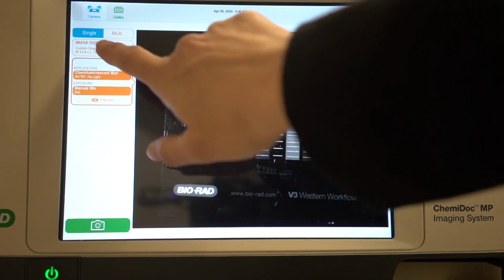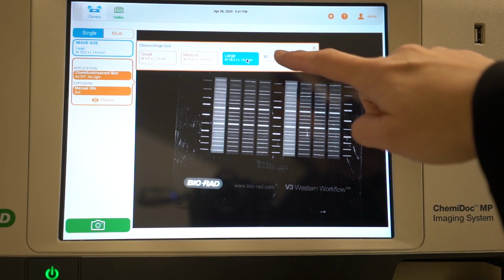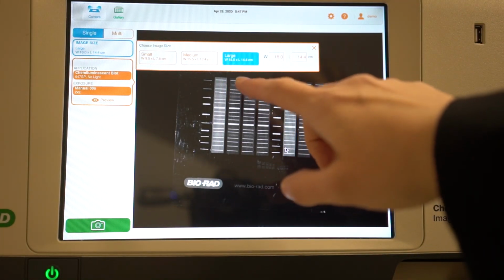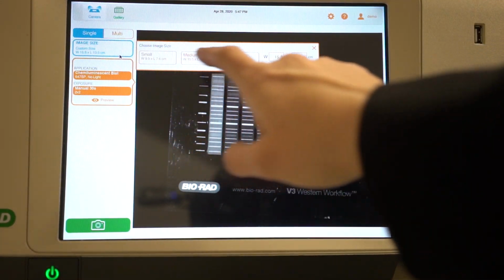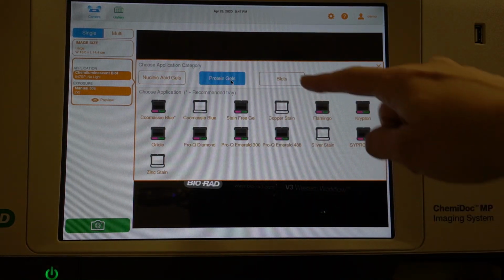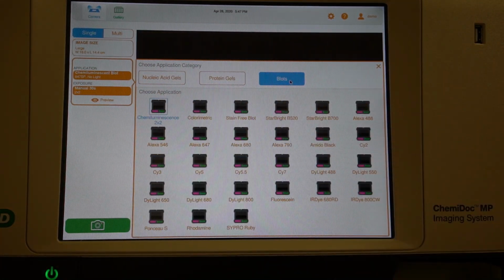The next block down here is your image size. So there are preset small, medium, and large image sizes, as well as the ability to manually change the size. If you would like to, you just touch on it here and it will populate with a box to put in the numbers. And you can also, like I said, use your fingers to adjust the size as well. Next here is your application. So here is where you choose which application you're doing, if you're doing nucleic acid gels, protein gels, or blots. And as you can see with the colors here, it tells you which tray you'll need for that application, whether it's a white tray, a blue tray, or the stain-free tray.